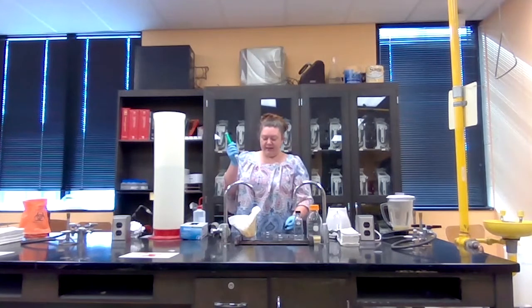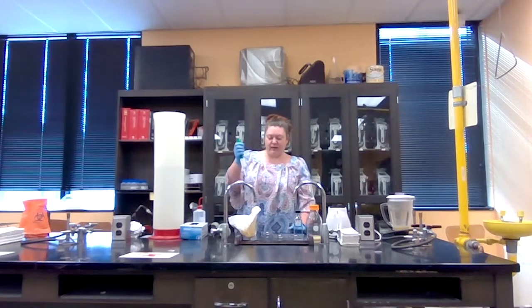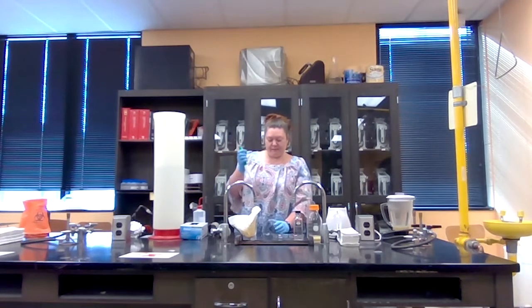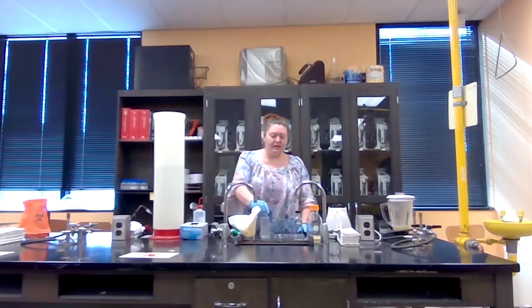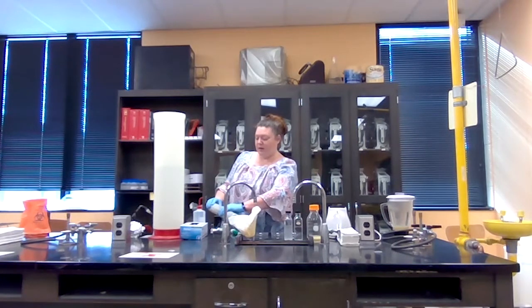All right, and then finally I want a 10 to the negative 3 plate. So I'm going to take 1 whole milliliter of my 10 to the negative 3 dilution and put it into my 10 to the negative 3 plate. Okay, here we are. So now I have my 3 plates. They have the samples in them.